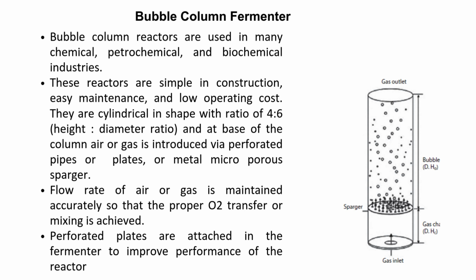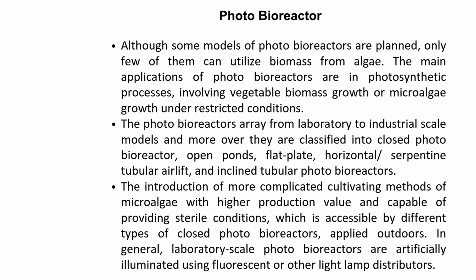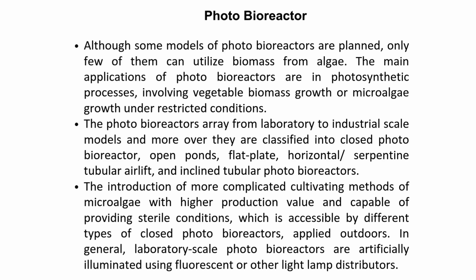Perforated plates are sometimes attached inside the fermenter to improve the reactor's performance. A simple diagram shows the key parts: a gas outlet at the top, a sparger at the bottom, bubbles rising in the column, and a gas inlet. Coming up, we discuss photobioreactors.